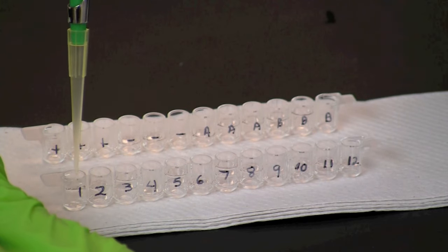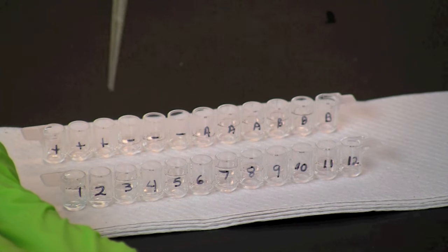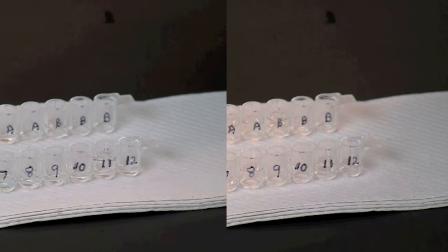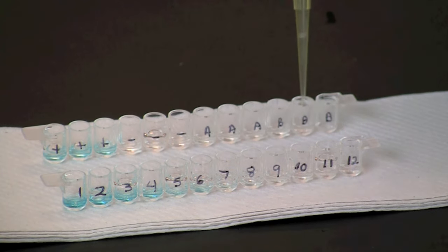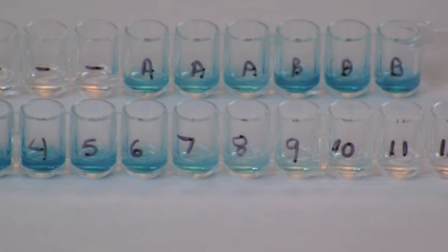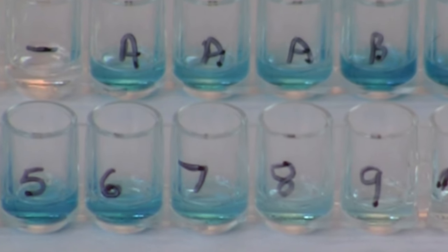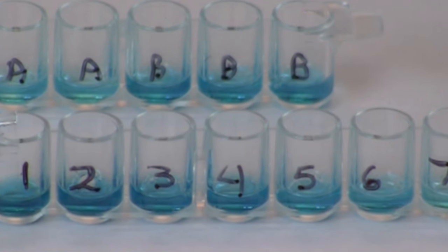Use a fresh pipette tip to transfer 50 microliters of enzyme substrate into each well of both microplate strips. Wait 5 minutes for the blue color to develop. Visually compare the intensity of the color in the test wells to the intensity of the color in the standards. Identify the standard that most closely matches the test wells and estimate the concentration of antigen in the test samples.